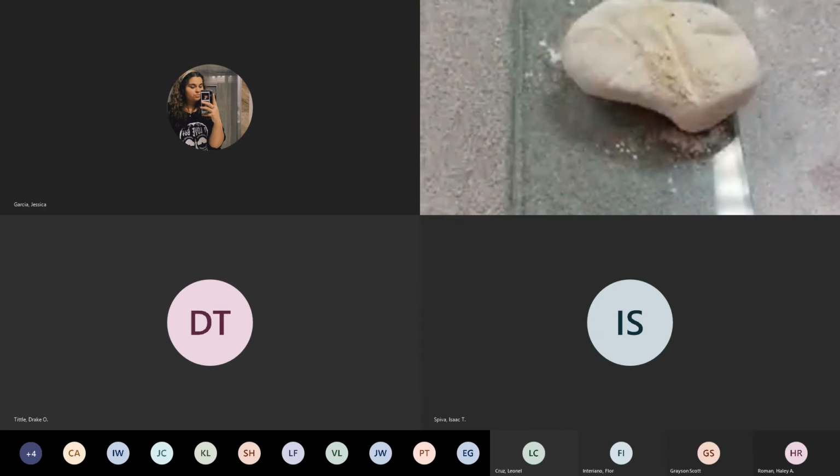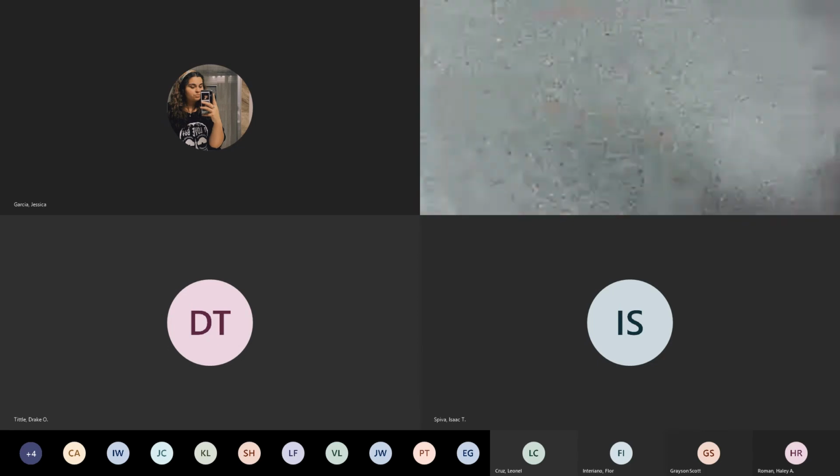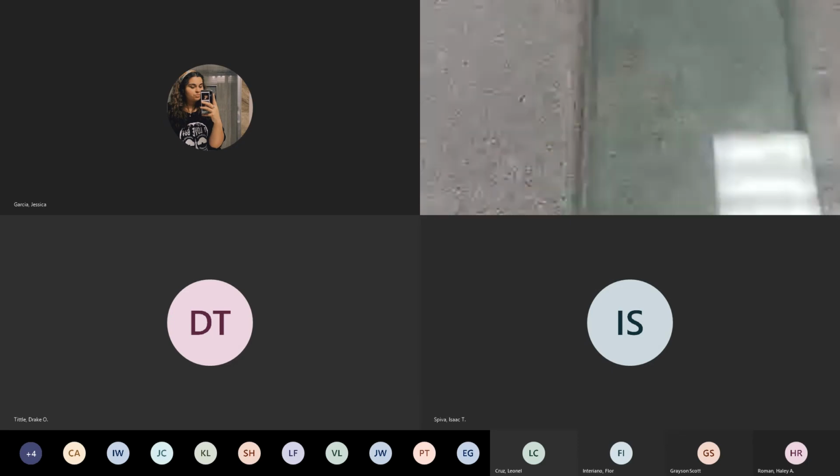And the penny. So it did not cut the glass, the penny cut it, and the fingernail cut it. So write down the hardness range, one of those 3 ranges. If you recall, those ranges are less than 2.5, 3 to 5, or greater than 5. I'm sorry, greater than 5.5.